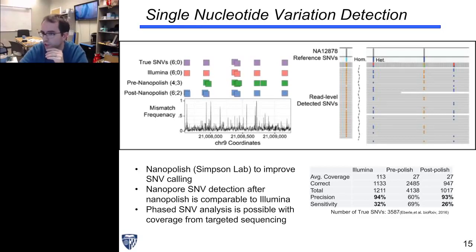In contrast, you can look at this other area to the right where we have a heterozygous SNP. And you can see that we have areas where there is no SNP on these first 2 areas, and then there is a SNP here on the right side. Similarly, we have areas where there's this SNP and this SNP, but nothing here. So we're actually getting phased information across stretches of the genome.